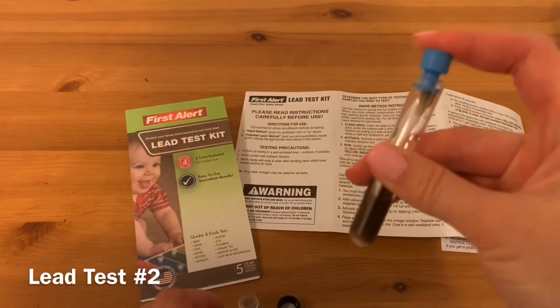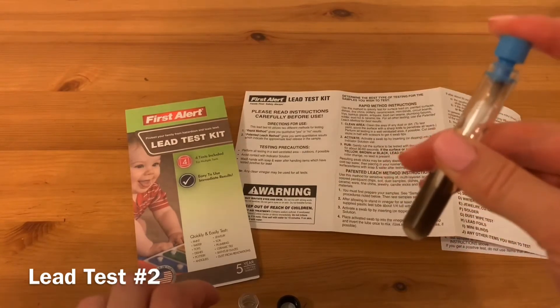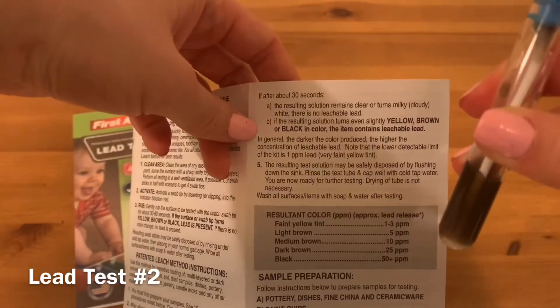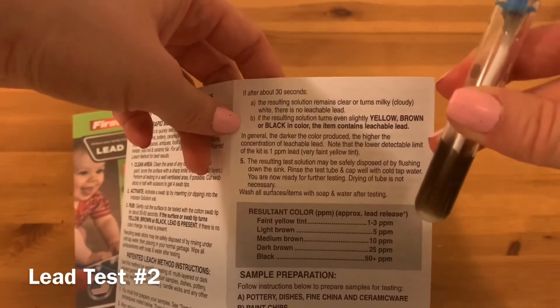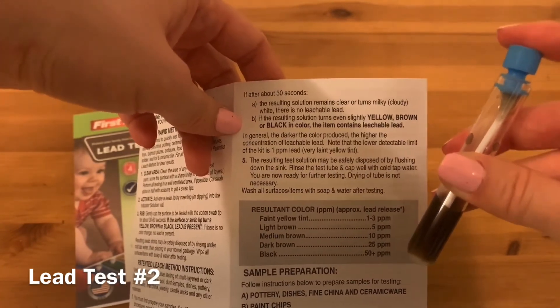If after about 30 seconds the resulting solution remains clear or turns milky or white, there is no leachable lead. If the resulting solution turns even slightly yellow, brown, or black, the item contains leachable lead. Black color indicates there is more than 50 parts per million of leachable lead.